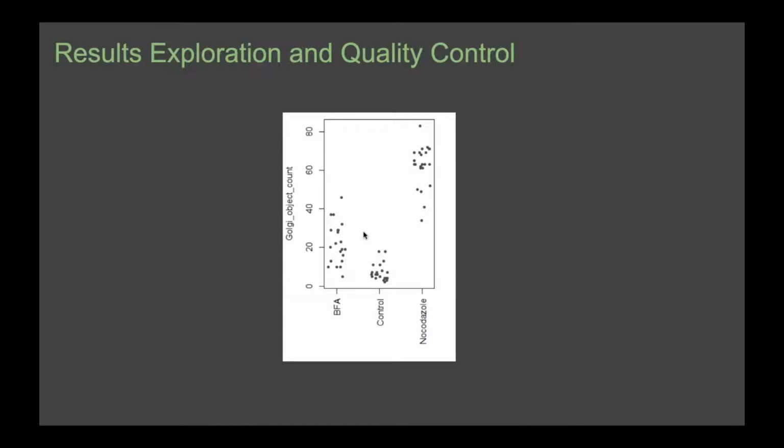I think it's zero. It becomes a bit more if you want to do batch analysis. So if you want to do the same thing several times and basically loop over a folder, then depending on the software, you sometimes need to write a little bit of code. But I think KNIME is also an example where you can get very far without any programming. So I think you can get quite far without.